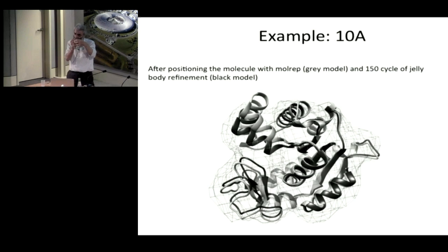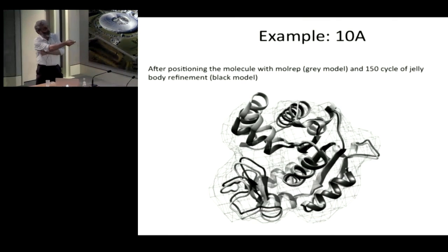If you take only very local information corresponding, let's say, to secondary structure elements, let's say 4.2 angstrom is the default value, then secondary structure elements will move together, but there will be conformational movements. If you look at that, for example, that helix moves into here in concerted fashion, and that loop moves into here in concerted fashion.